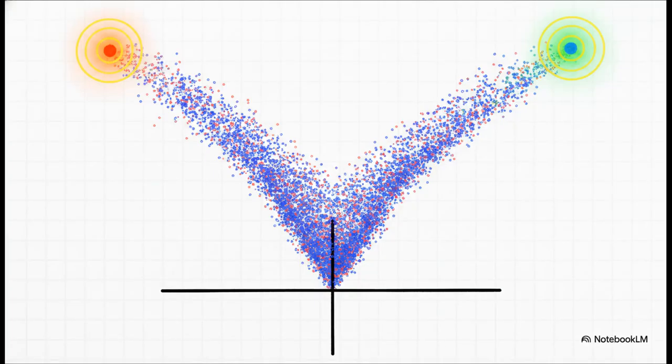And finally, Section 6, Visualizing the Final Picture. To actually make sense of all this math, our sources highlight statistical packages like DESeq2, which generate some pretty famous visualizations. First is the volcano plot. I love this one because it visualizes all your genes simultaneously. The x-axis shows the fold change, meaning how much a gene's activity went up or down. The y-axis shows the statistical significance, basically how confident we are that this isn't just a random fluke.